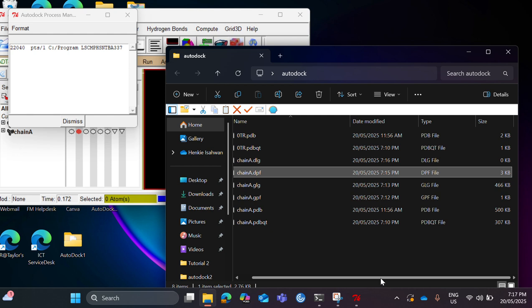So you can look at this current file, the DLG is 0 size, because they are uploading the data for the DLG.